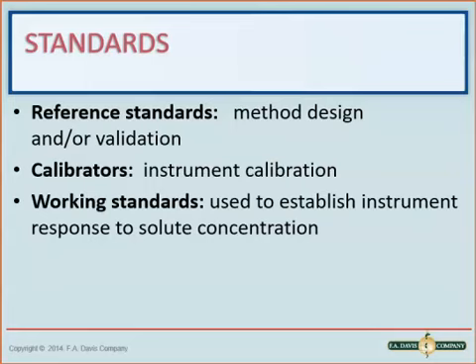Our reference standards are usually of known concentrations. So if we run a reference standard, we know what it should read out as. If it doesn't come out exactly what we know it should be, then there's probably something wrong with our instrumentation.